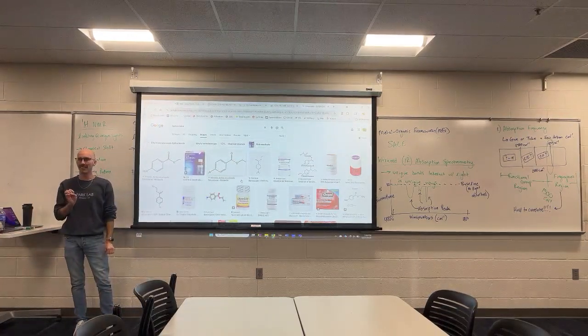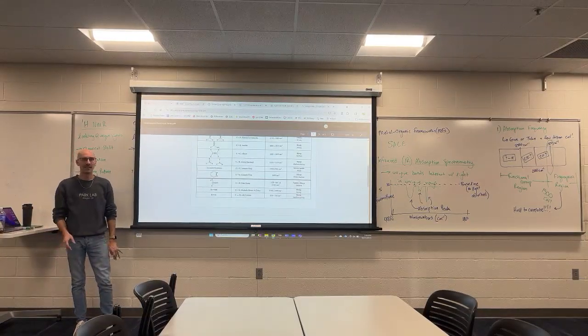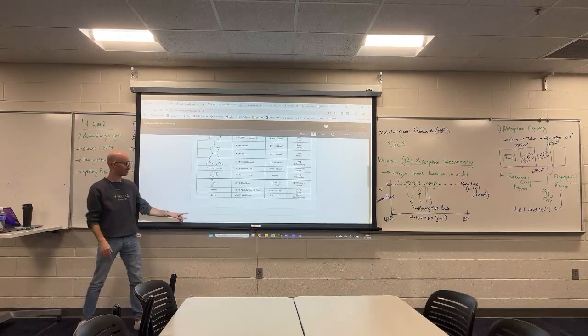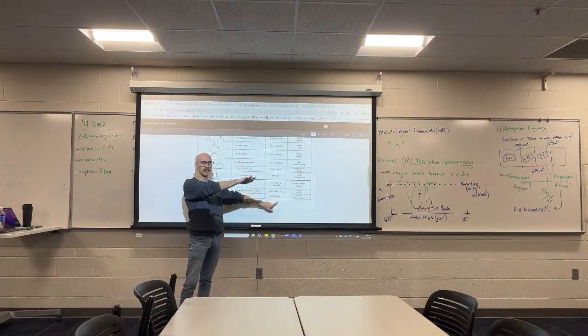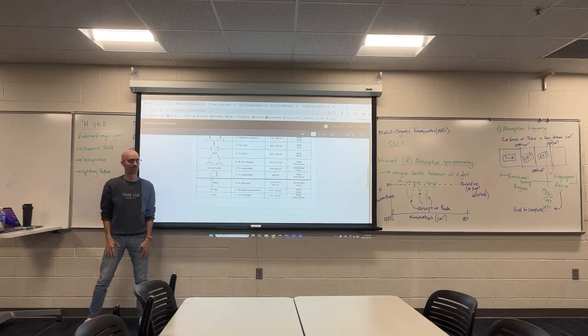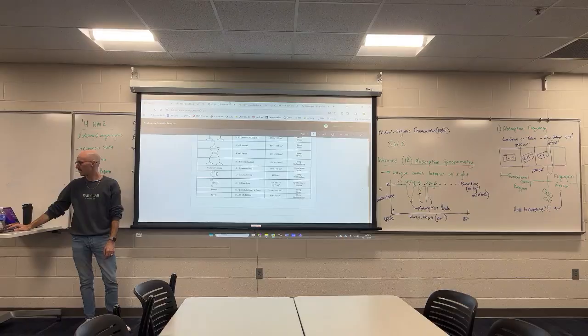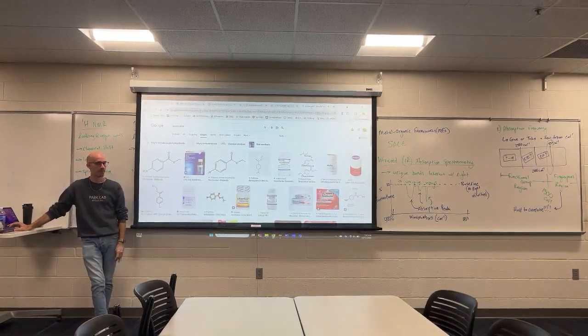Every single week, no matter what compound was being synthesized, this student would tell me, this compound has alkyl halide. One of the functional groups in my compound is alkyl halide, because they were seeing absorption on that far end of the spectrum in the fingerprint, and they said, well, the only thing that it could be is a C to X bond. Is there any alkyl halide in benzocaine? No halogens at all. No alkyl halide.